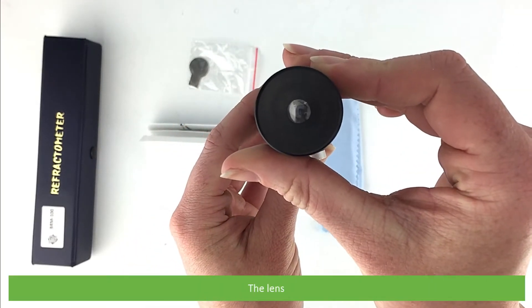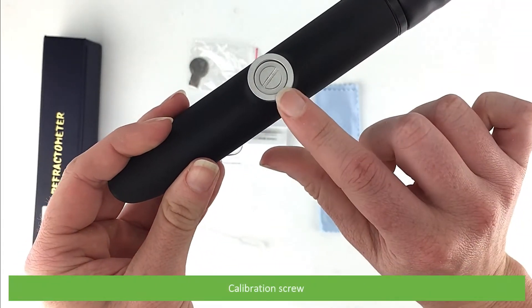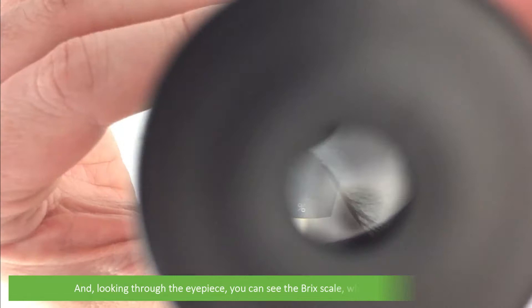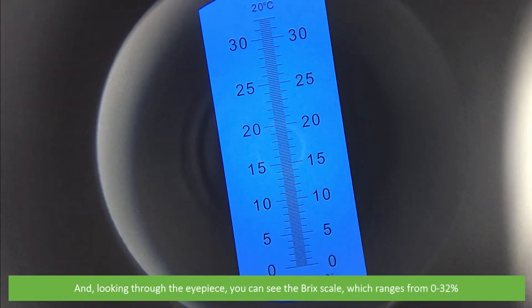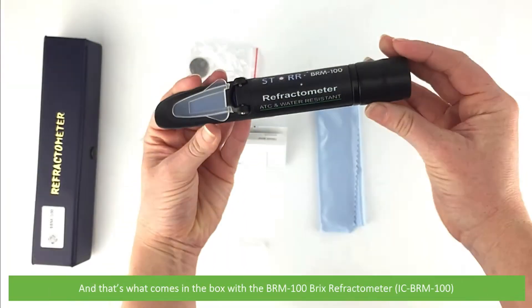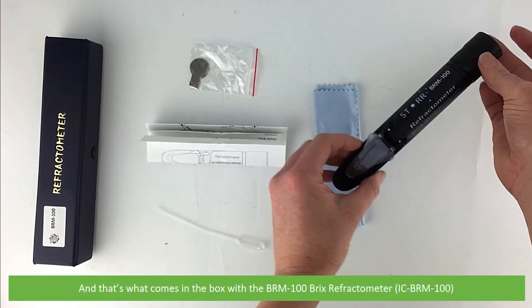the lens, calibration screw, and looking through the eyepiece you can see the Brix scale which ranges from 0 to 32%. And that's what comes in the box with the BRM100 Bricks Refractometer.